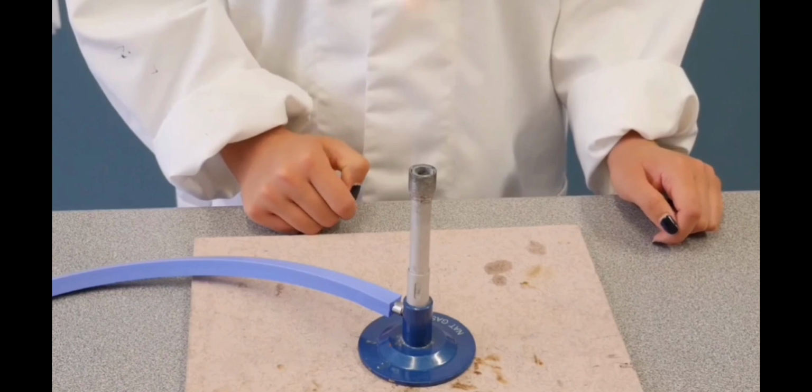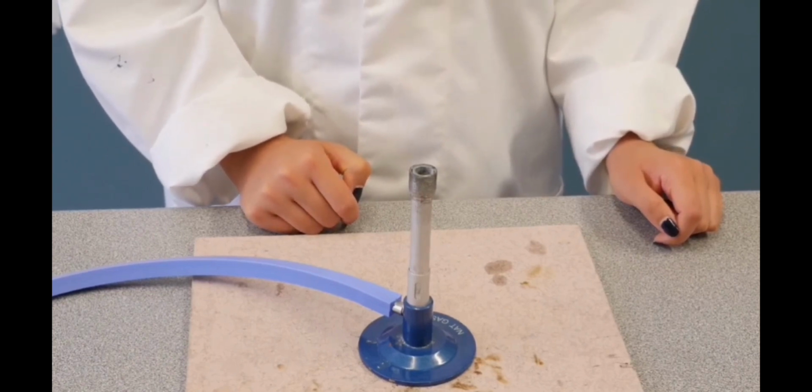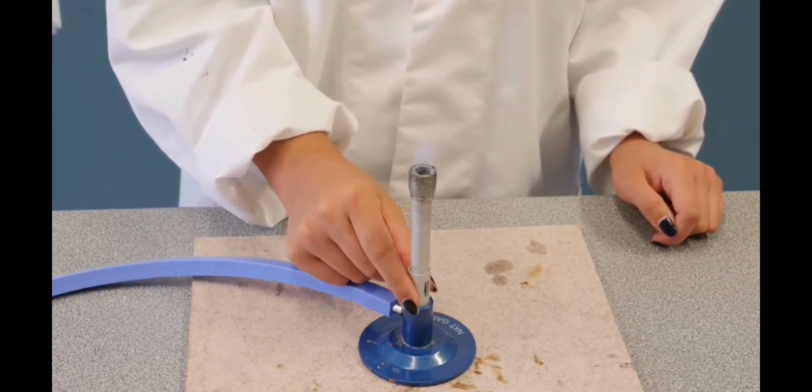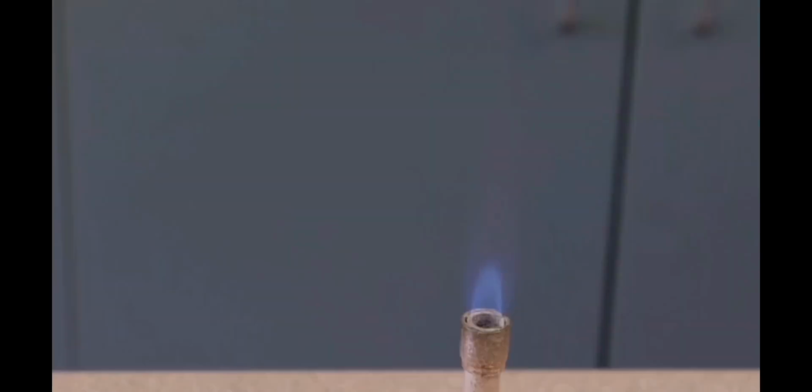This is called the safety flame because it's easy to see and isn't as hot as the full flame. To get a hotter flame, we need to mix in more air. To do this, turn the collar to open the air hole. You will now have a blue flame with a bright blue inner core. The hottest part of the blue flame is here, at the tip of the cone.